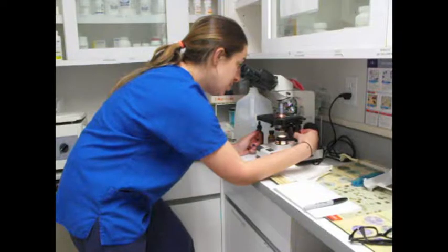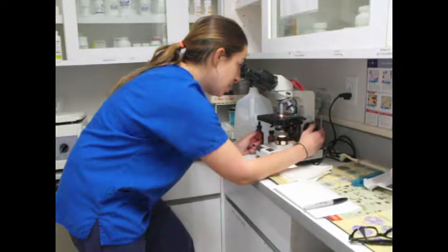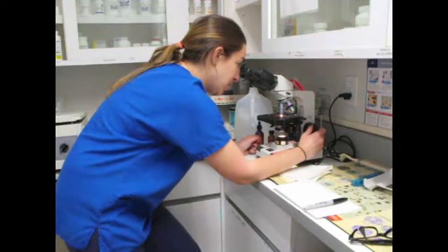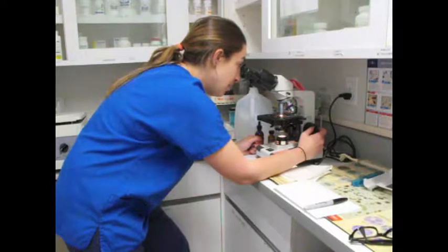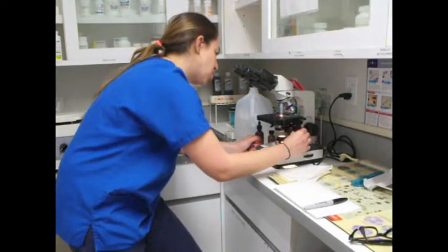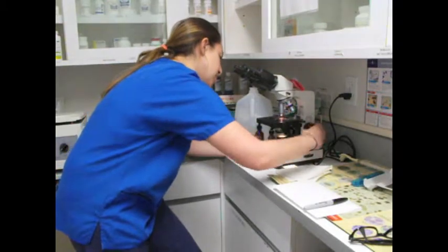Okay. I'm just doing a scan, making sure I'm in the proper area. Okay, perfect. So I can actually see some white blood cells in this view. They are a little difficult to make out and tell which is what, but we will see that on the next step. So the next step is the oil immersion lens.